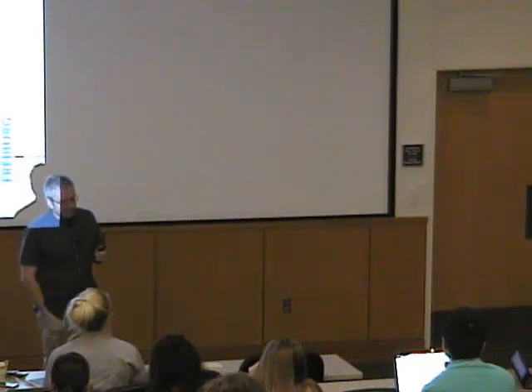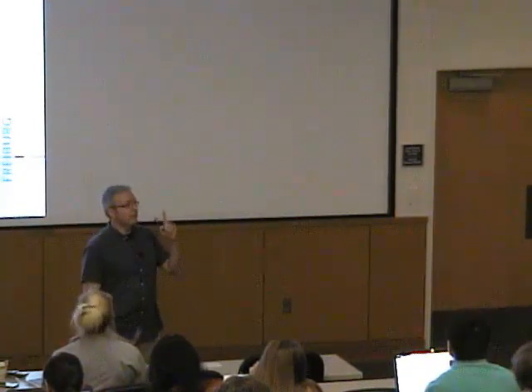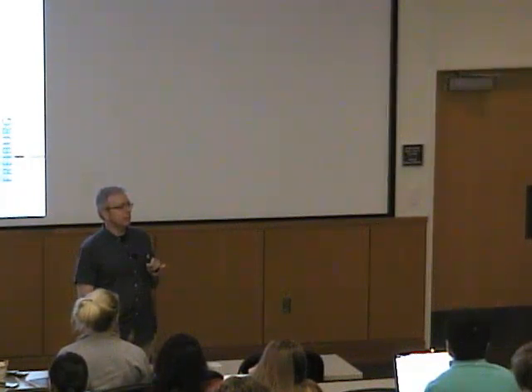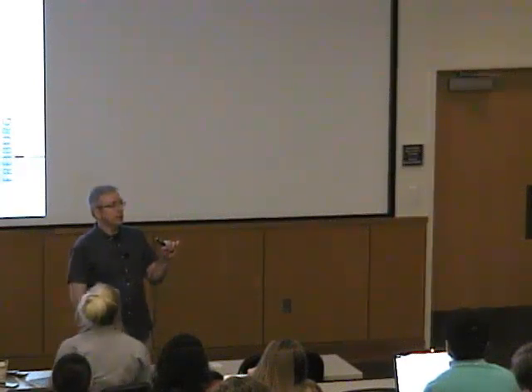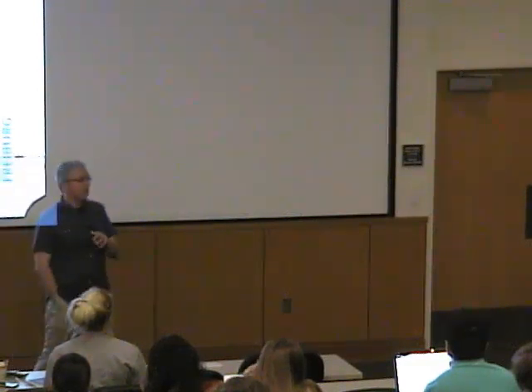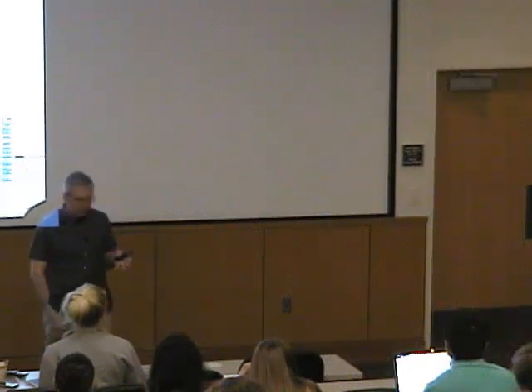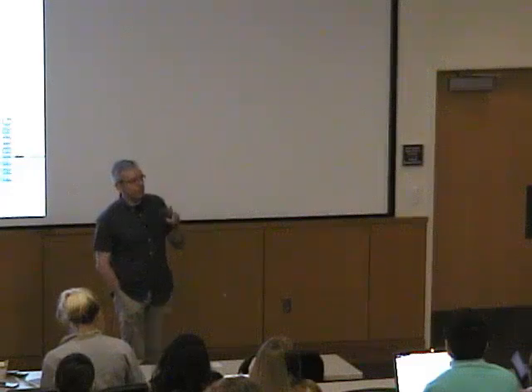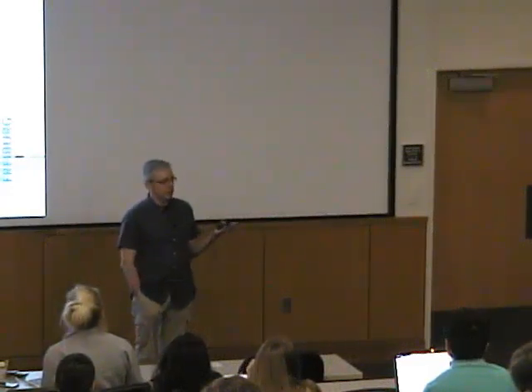And the other point I didn't mention in detail is that the phase angles we have in the end on a refined model are not the ones that we determined in the experiment anymore, but the ones that we take from our model. So if you start going the wrong way at the beginning of your structure solution, you can really get some bias in, you can really make some mistakes. There was a very unfair paper a couple of years ago where they showed that there is an inverse relationship between structure quality and the impact factor of the journal that it's published in.